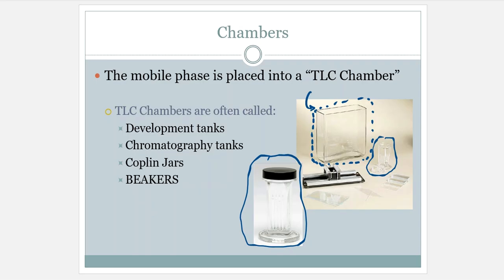They've got a glass backing. They make wonderful little test drives of plates before we ruin the real thing. And we've got chambers that are specifically meant for that type of situation. If that's something that we want to do, then absolutely that option is out there for us. And it has little lids that we can screw on. We can get that gas phase to develop and whatever the case might be.